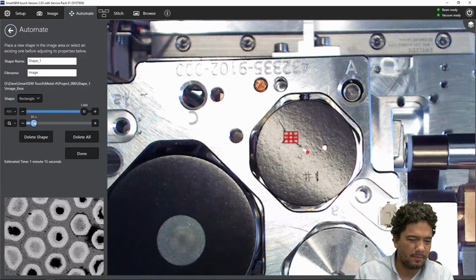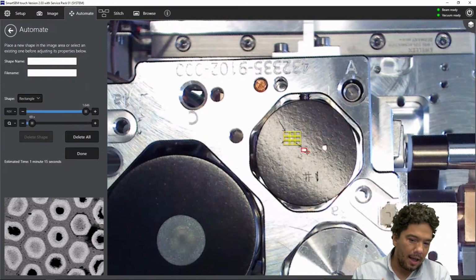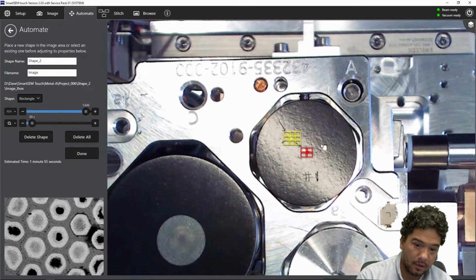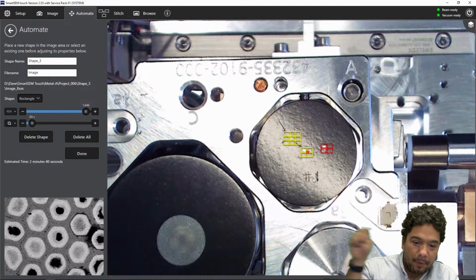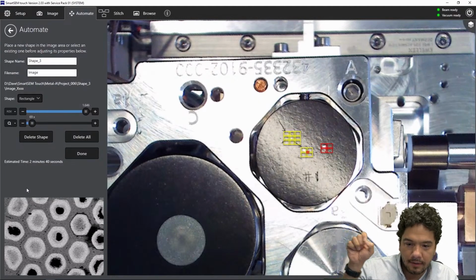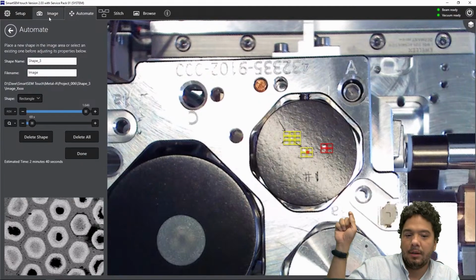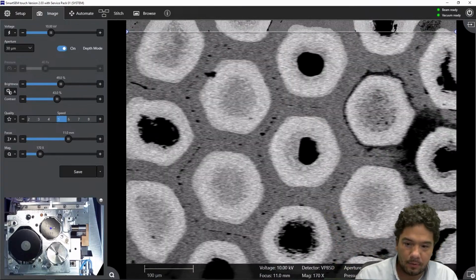You don't have to waste time, and you can see live, if you change the magnification, how the field of view changes, and how many tiles you will get in your final result. And you only drag that. Here, for example, we have 3 different, very near areas, and you don't want to mislabel these areas because, of course, you have the information where this information came from, right?